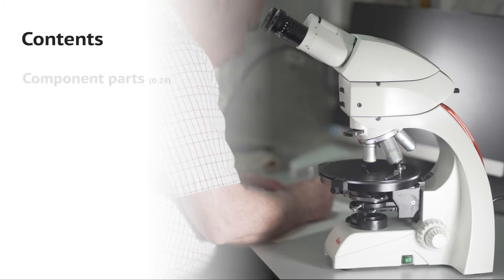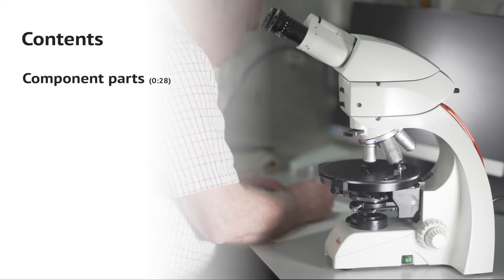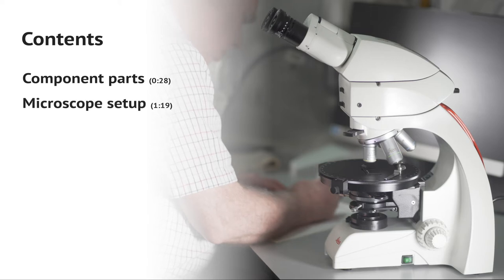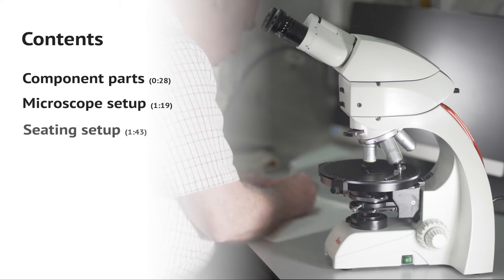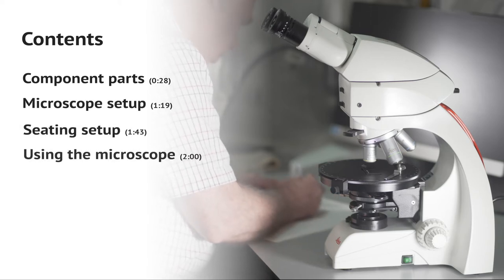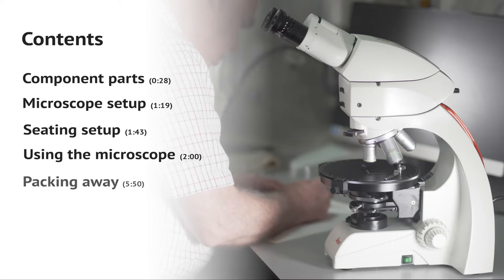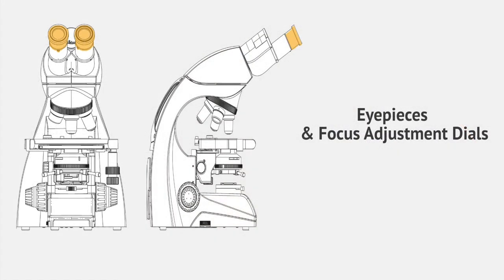In this tutorial we will cover the component parts of the microscope, how to collect and set up the microscope, setting a comfortable working position, using the microscope, and finally packing away.